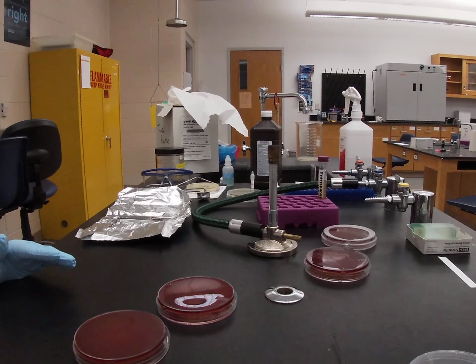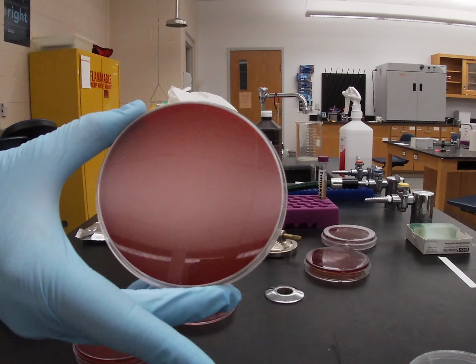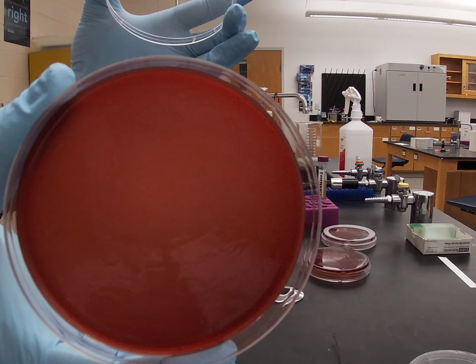Tryptic soy is a general purpose supportive medium that has lots of different nutrients in there that most things can grow on, but it's enriched with that 5% sheep's blood in order to make it a better environment for really fastidious organisms like the streps. The streps grow really well on blood agar. So blood agar is an opaque red plate. It is very red and you cannot see through it under a normal basis.